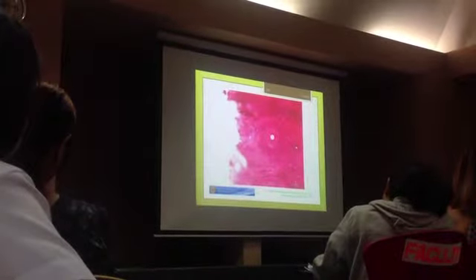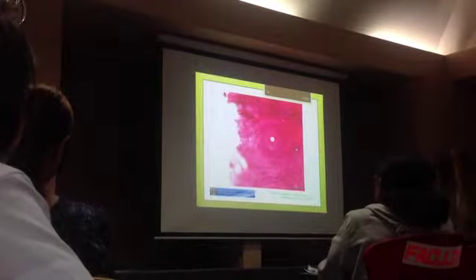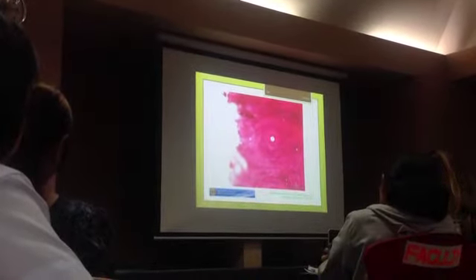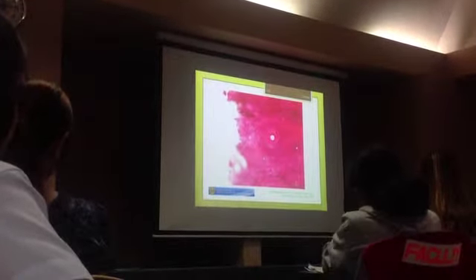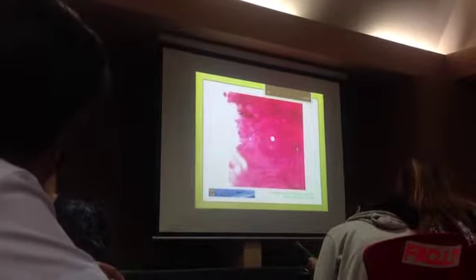Classify pointed tissue, be specific. Classify according to histology.